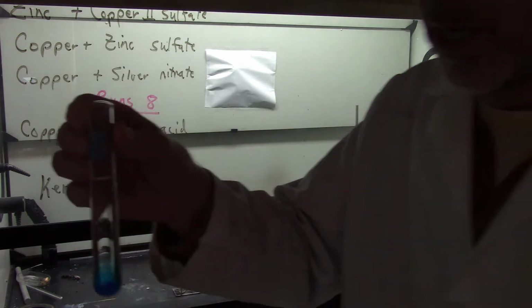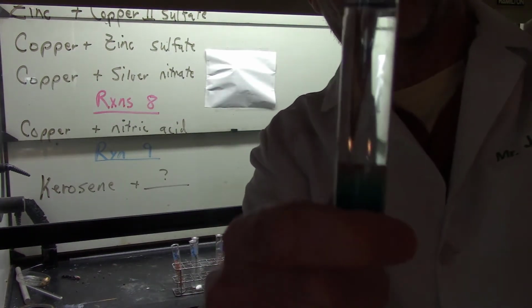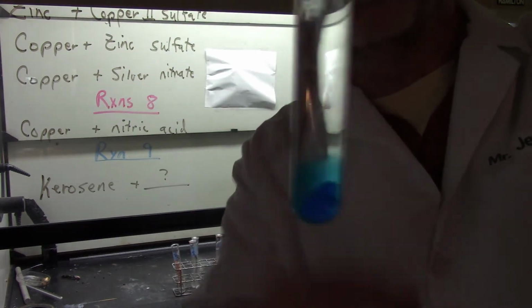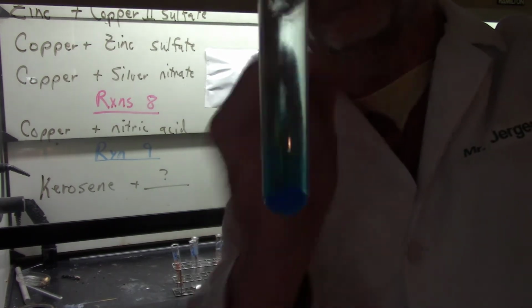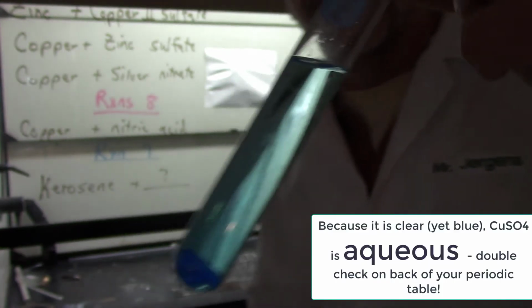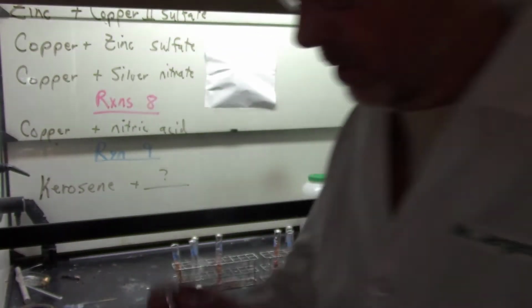And when you put the copper 2 sulfate into water like you did last night, I thought it would maybe be blue all the way through, but I'll give it a little knuckle bust here. Make a whirlpool. There's my copper 2 sulfate. So you can see it's blue all the way through. And when you put those together, does a reaction occur or not?